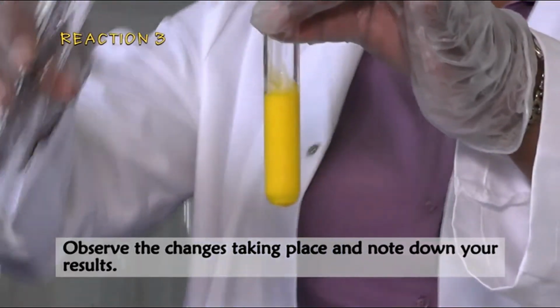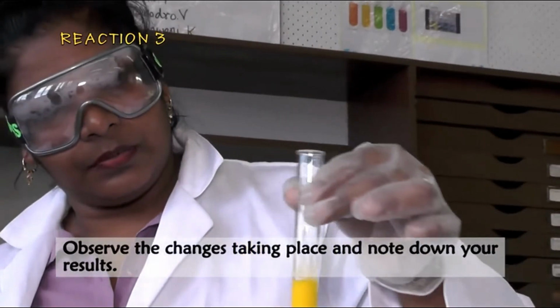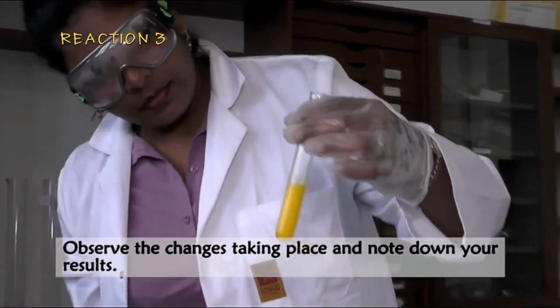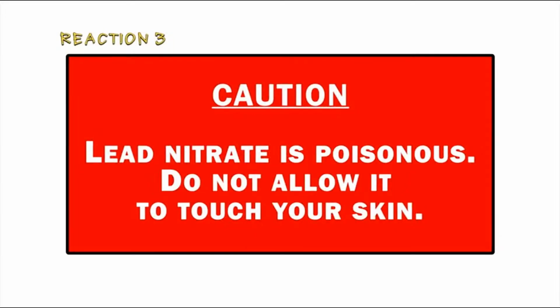Observe the changes taking place and note down your result. Also remember that lead nitrate is poisonous and do not allow it to touch your skin.